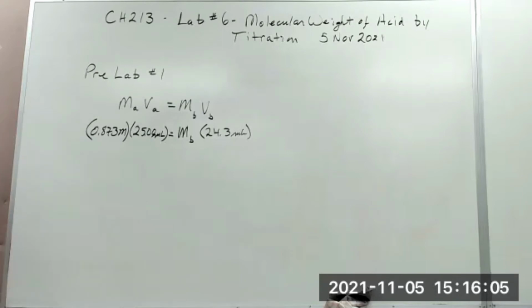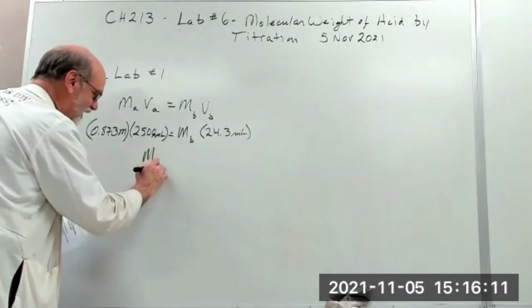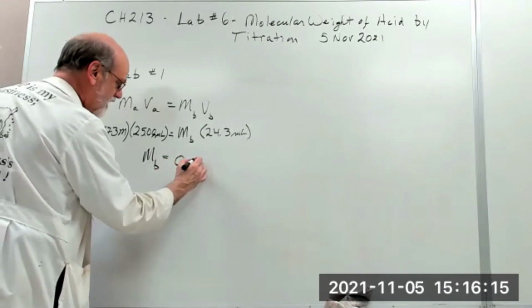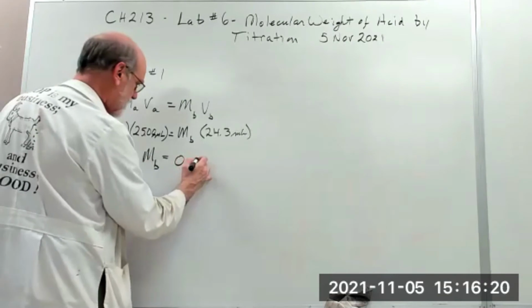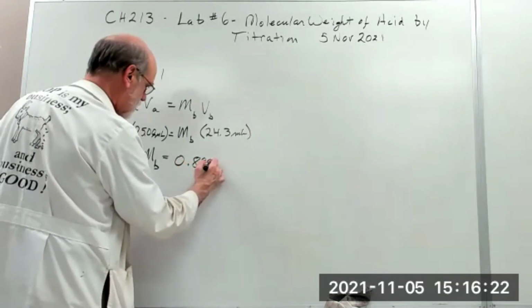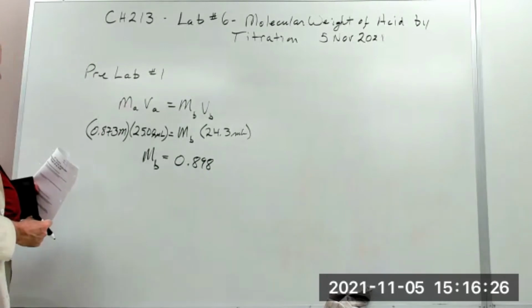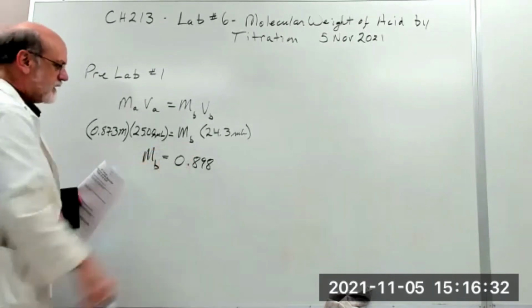Do what? I did it. Oh, okay. Saving me the trouble. Thank you. What was it? It was 0.90 if you want to round up. Give me 3 significant figures. 0.898. That goes for 1, so I just round it. Yeah, 0.898 molar solution. Yep.